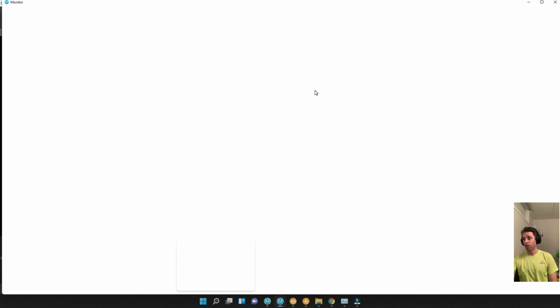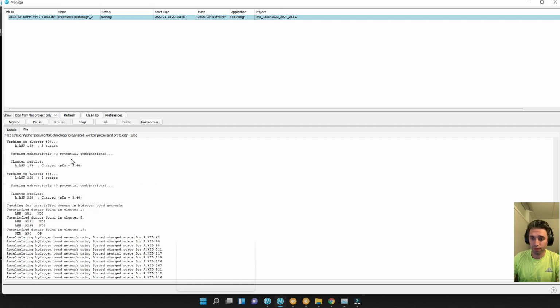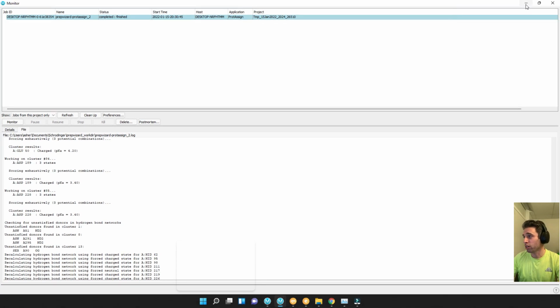If you want to monitor the job, you can double click a job and that'll take you to the actual job that is being run. Okay, and then it says finished right here, so it's done.